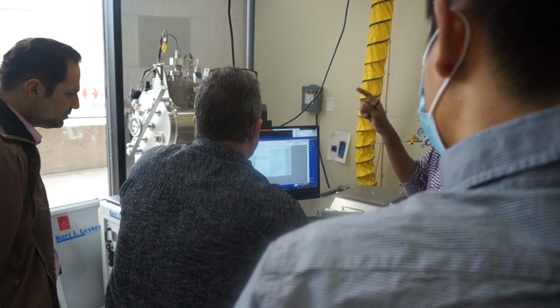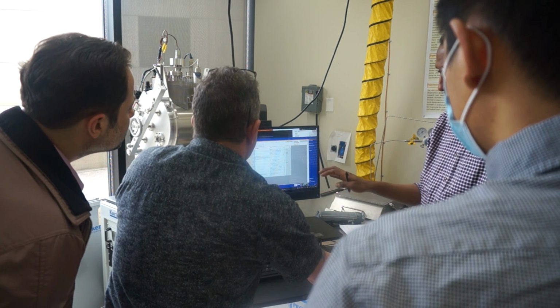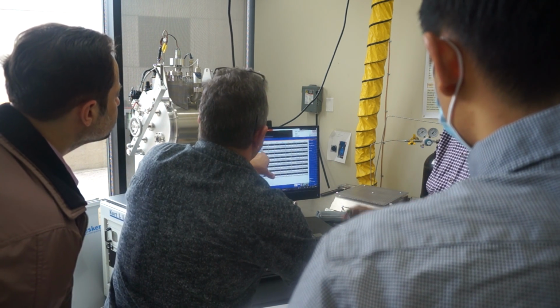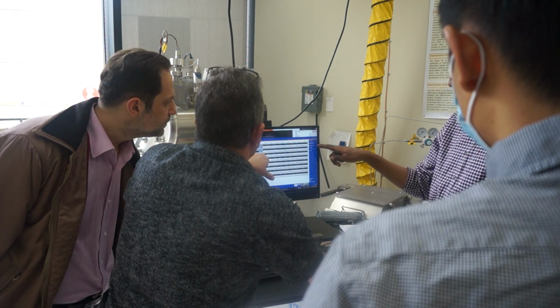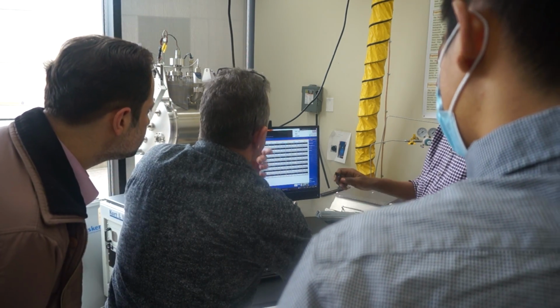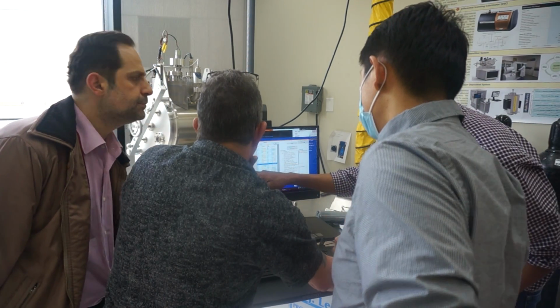So that will be done on the screen previously, right? You did that on the position screen. You change the name if you have two precursors. That would change it on this screen, and it will automatically change here also on the recipe editor. The name also will change. Right. So now you're going to load a different recipe. That recipe will have to be... So we have.